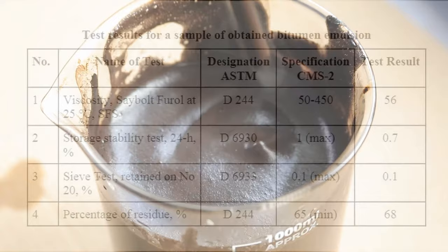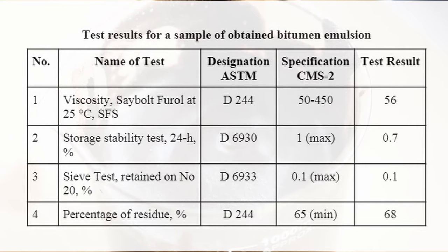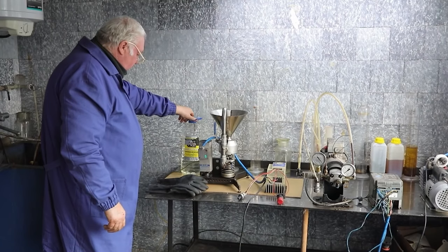After operation, the mill should be flushed with any solvent. In this case, we pour 150 milliliters of kerosene. Flushing is necessary so that the knives inside the mill would not stick together. Finally, we flush the colloid mill with water.